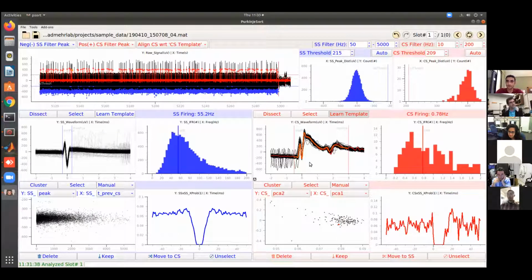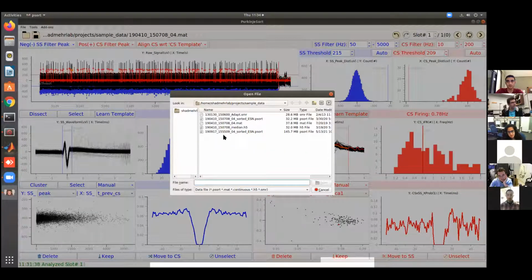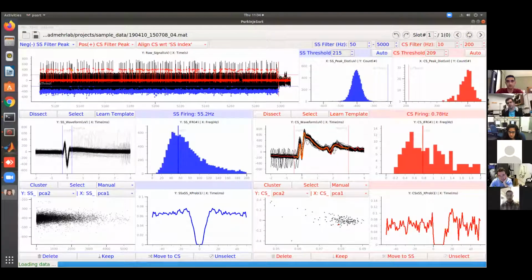Okay, so this was a very good session, with very high quality data. I have my LFP content and I have the actual signal. Let me now move on to a session that does not have the LFP content.